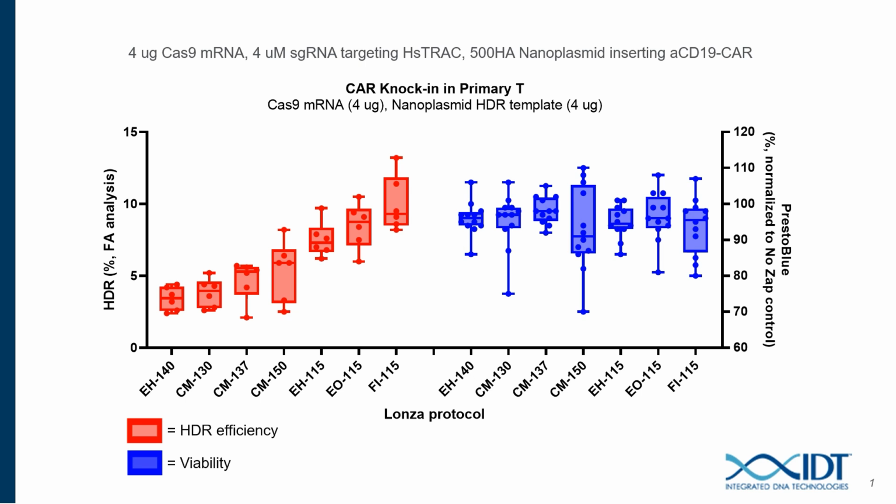Another important factor is the delivery method. At IDT, we typically use the Lonza nucleofection system. We see good efficiency with this and good cell viability, but the optimal delivery strategy can come down to the granularity of exactly what electroporation settings to use.